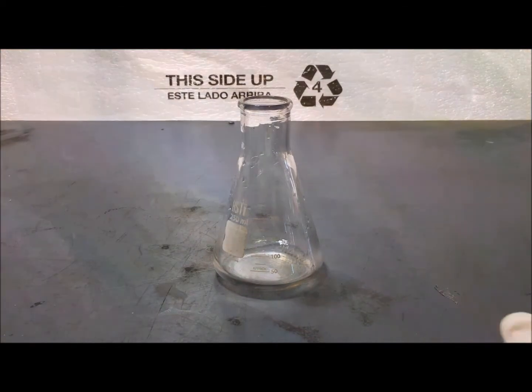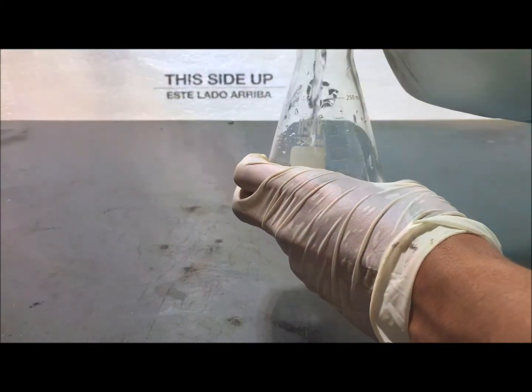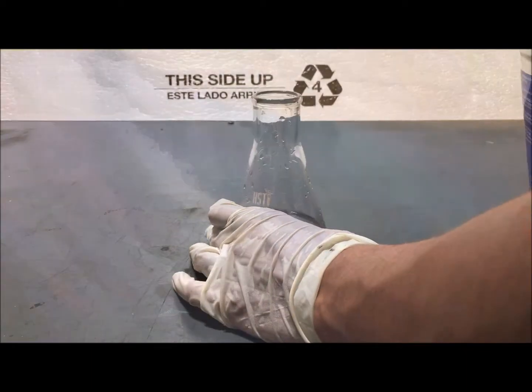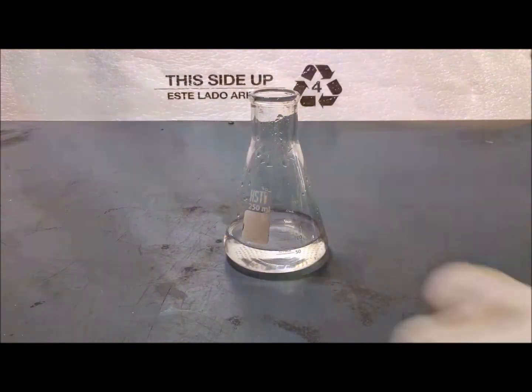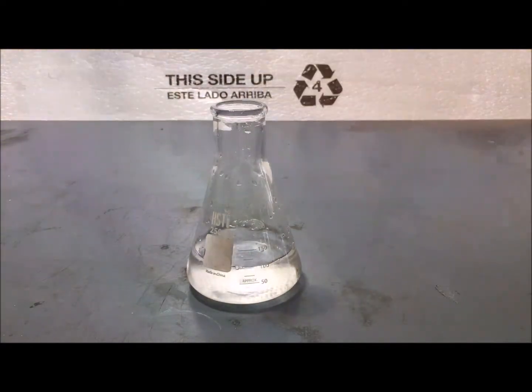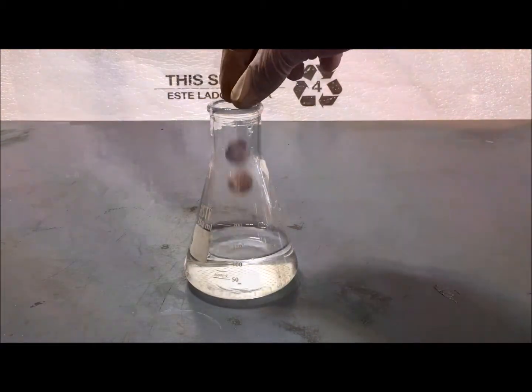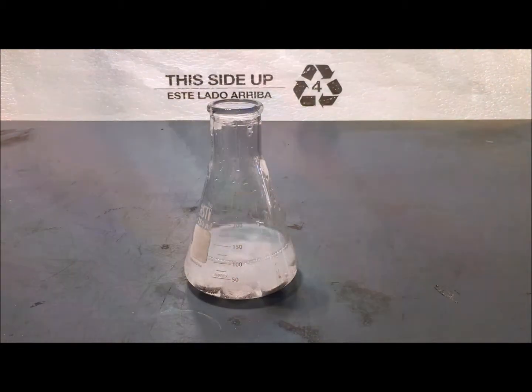I then poured 50 ml of hydrochloric acid into a beaker or flask. And to that I added another 50 ml of water. I then added the pennies into the solution.